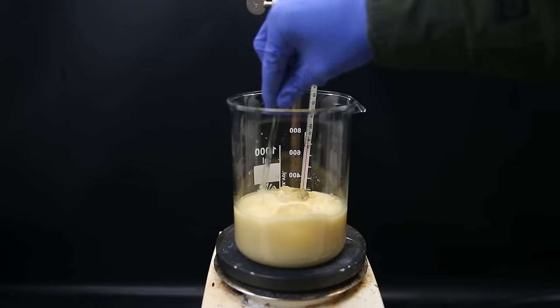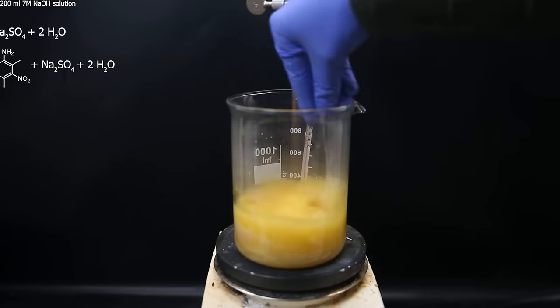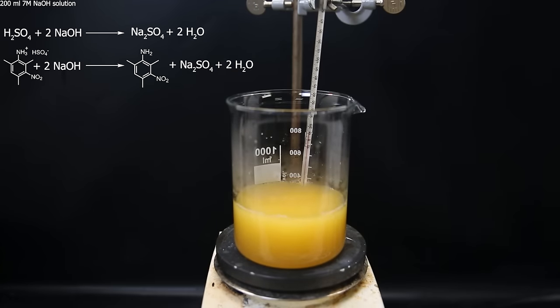Now to destroy any remaining acid, and to make sure that the amine is in its free base form, I keep adding a 7 molar sodium hydroxide solution, until the mixture is alkaline.